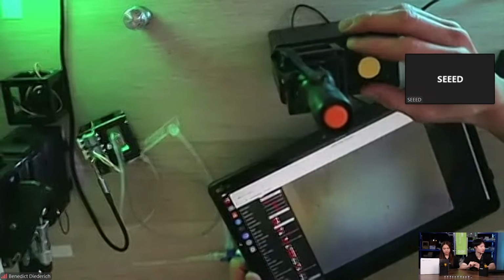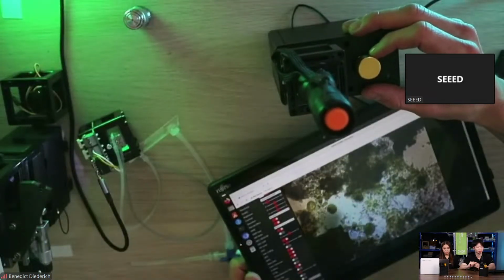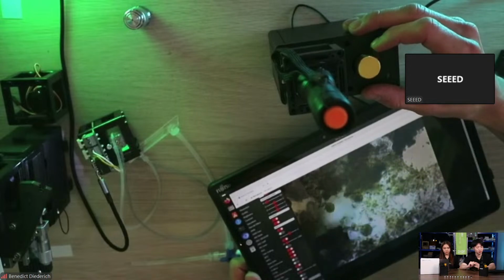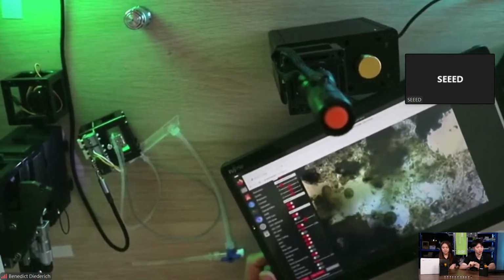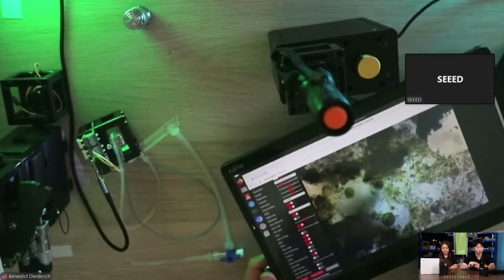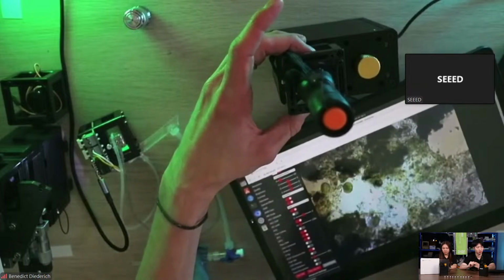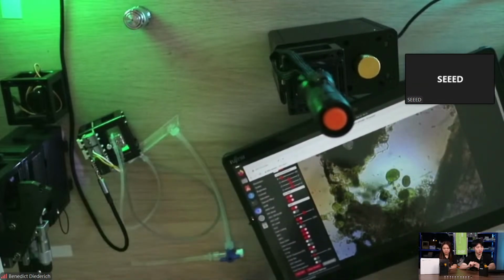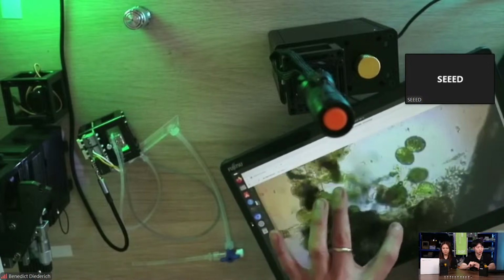This is water from the pond nearby. Unfortunately it was rather cold the last few days because in Germany there's already fall. So the stuff that is floating around in the pond is kind of frozen now. There's not so much life going on anymore. What you see here is some algae, some single-celled organisms, and they're pretty intensely living here. They're floating around, so you can zoom in.